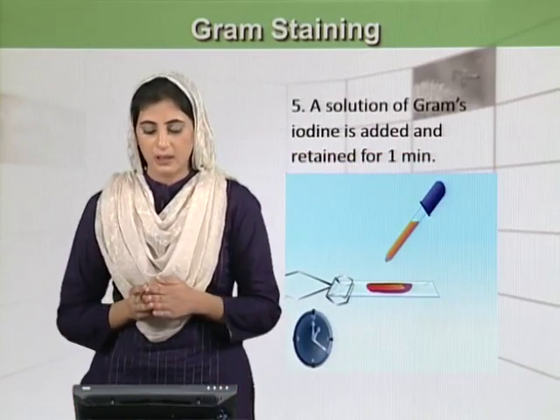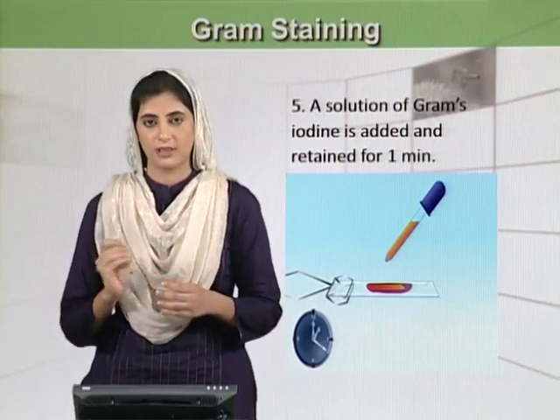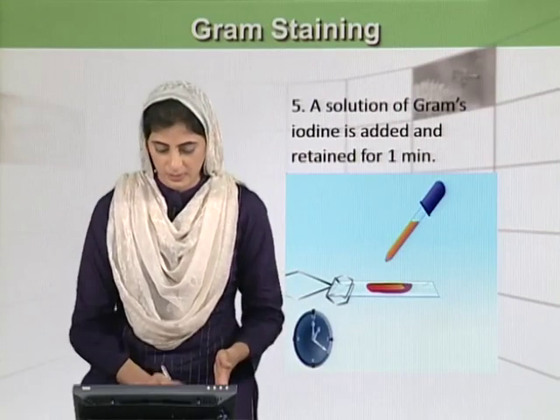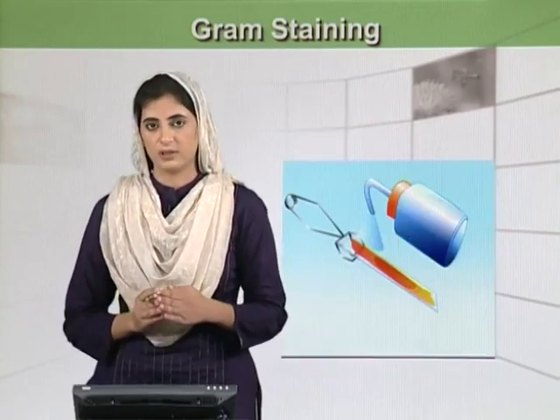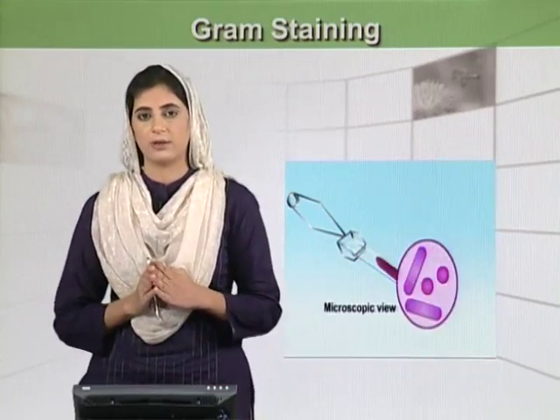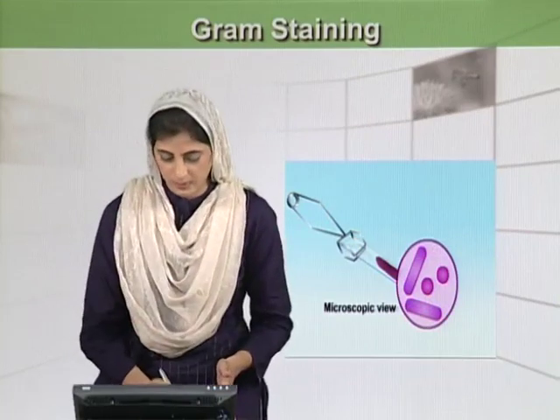In the next step, a solution of gram iodine is added on the slide, and it should be retained for a period of 1 minute, and after this it is rinsed with water. Again, if we observe under the microscope, all cells will appear purple.